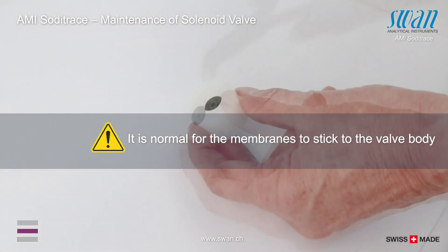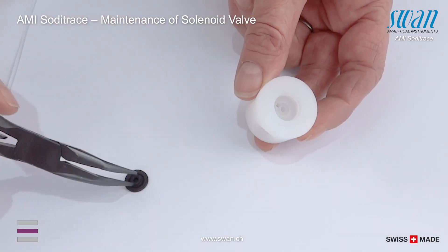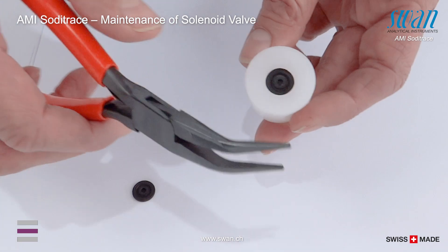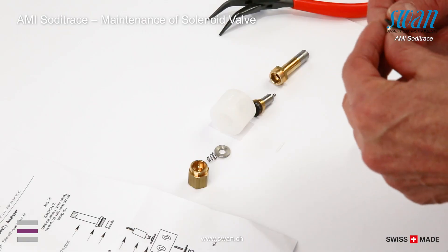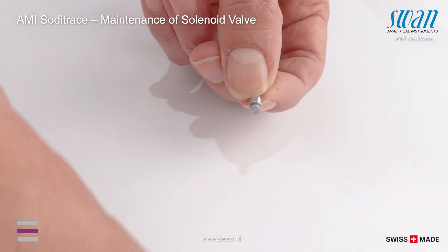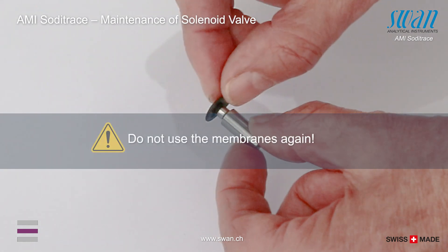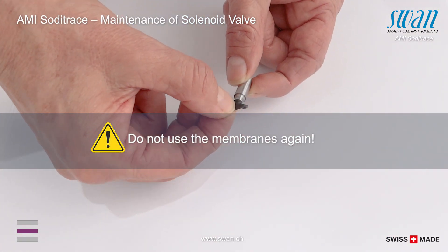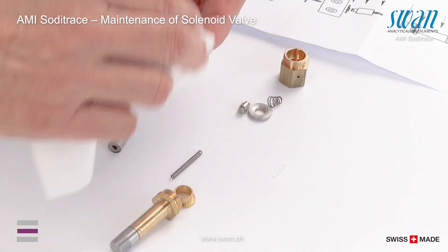If the membrane sticks to the valve body, remove them with pointed pliers. Clean the valve body with soft detergent.